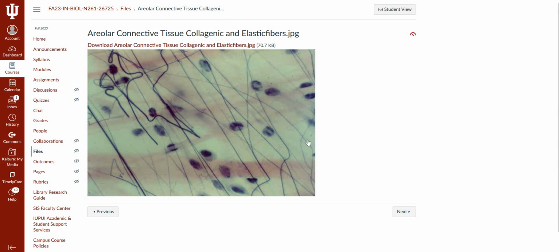And generally, this kind of tissue is found around organs, actually, the specialized cells of organs. So this meshwork is going to form the infrastructure of organs. And so there's not a lot of examples that show it, but you can imagine this type of tissue in the soft internal organs. We have it around lymph nodes. Bone marrow is going to be an example. So we'll find this all over the body.